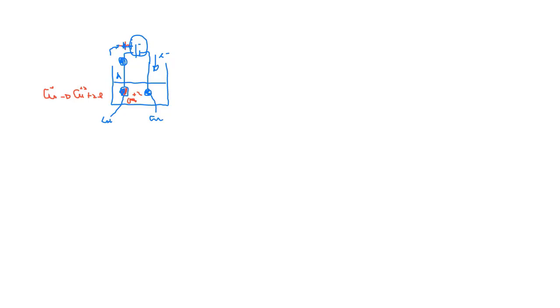So when you look at the data, you will see the weight loss of the copper, and you know that each time you are dissolving the metal and recording the weight loss of the copper attached to the positive terminal.